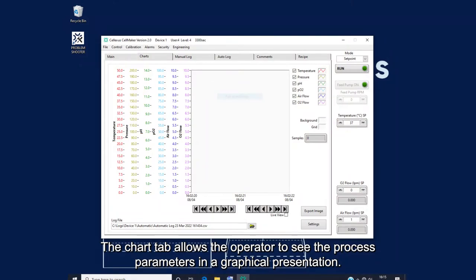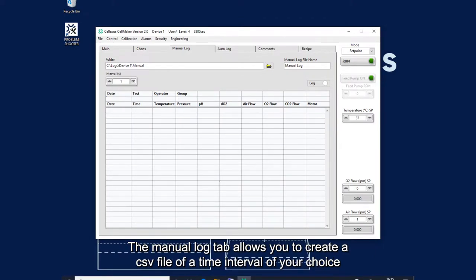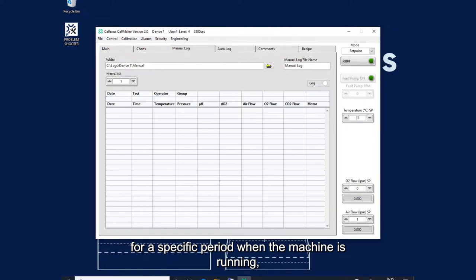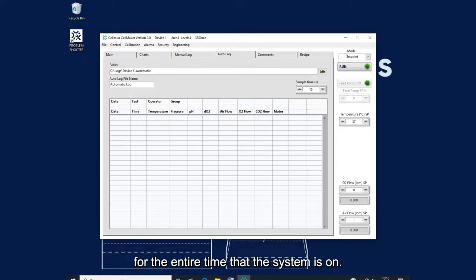The chart tab allows the operator to see the process parameters in a graphical presentation. The manual log tab allows you to create a CSV file of a time interval of your choice for a specific period when the machine is running. Otherwise, you could obtain the CSV file from the auto log that records information automatically for the entire time that the system is on.